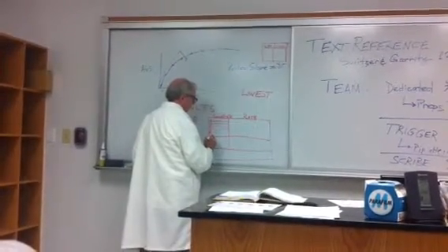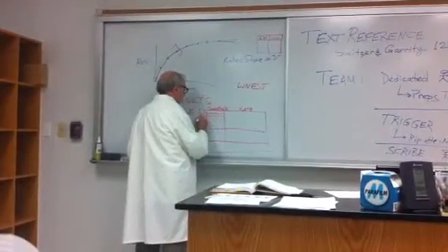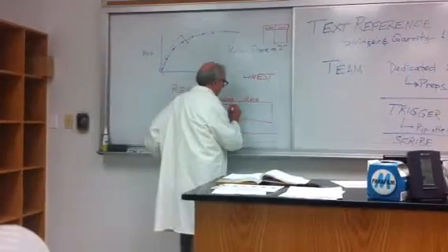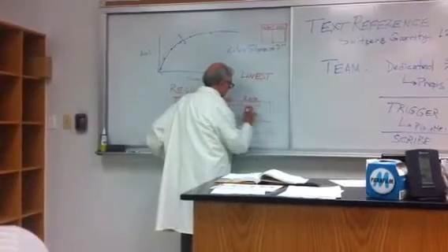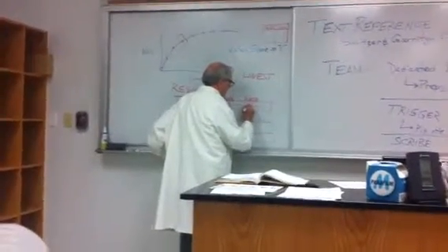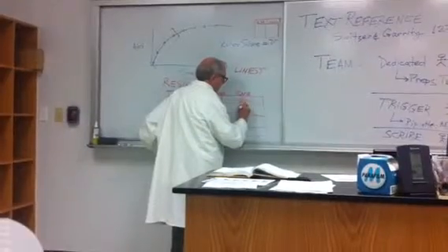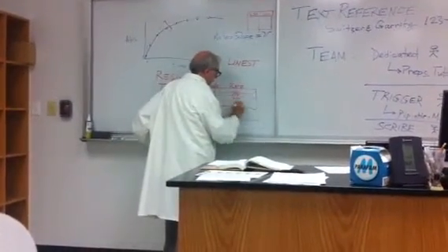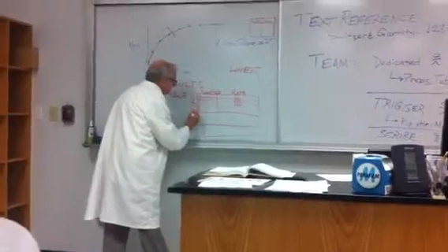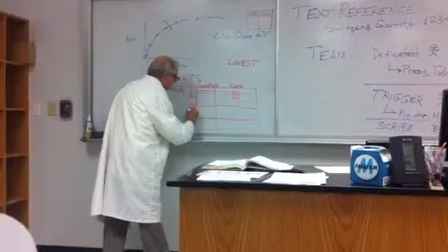Okay. And that means that over here you have no inhibitor. And so we can see the rates. You can see a rate here, a rate there. So this is XXX. This is YYY. This is ZZZ. And so on. Okay? Got the idea? Now, over here, then, let's say it's MTG.